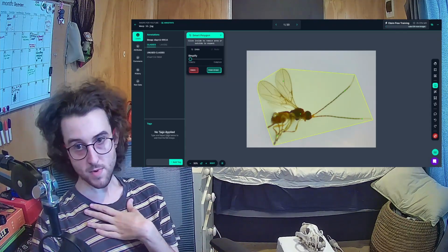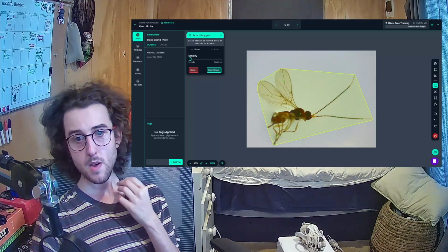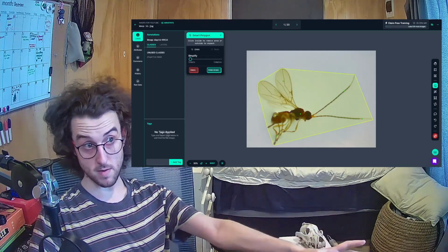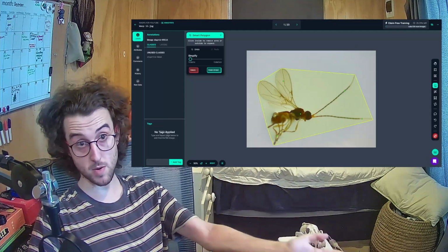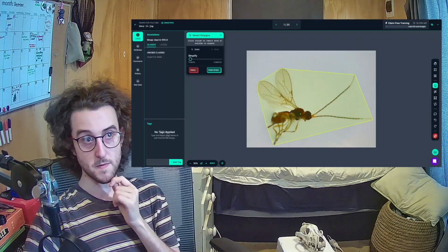I just use simple myself, because I'm just an everyday person in a usual scenario. So I think simple is good. You want to minimize the computational load, but if you are doing really, really high-tech stuff and you need the precise polygon detection, then go for it. But you are going to need a really good computer. So, with that done, we click Finish.